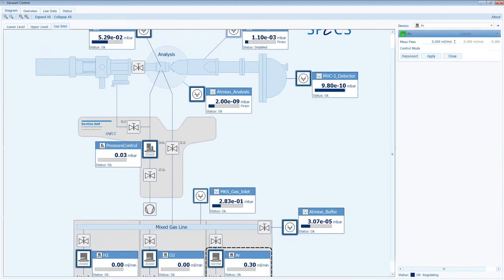I already did it before during Misha's talk to test if the cell is sealing. And you can see the 28, which is CO, carbon 12 plus oxygen 16, 12 plus 16 is 28. And you also have double ionization of the CO molecule, around 14, and 12, which comes from the carbon. So these are the products that are actually analyzed in the QMS.